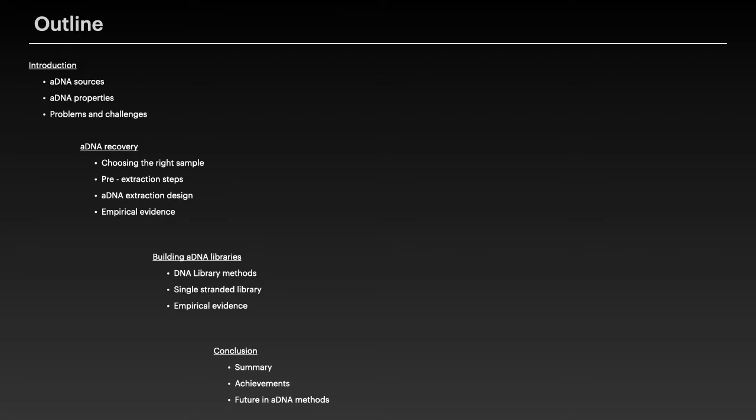So first let me give you an overview about the content of this presentation. I will begin by talking about the source of DNA, where do we actually find it, what makes DNA ancient, its properties, and what are the usual problems we encounter when working on ancient DNA samples. Then I will move on to the extraction, discussing some common issues one must take into consideration before the actual extraction step. I will continue with the extraction method design, and in the end of this section I will provide some empirical evidence on the method's performance.